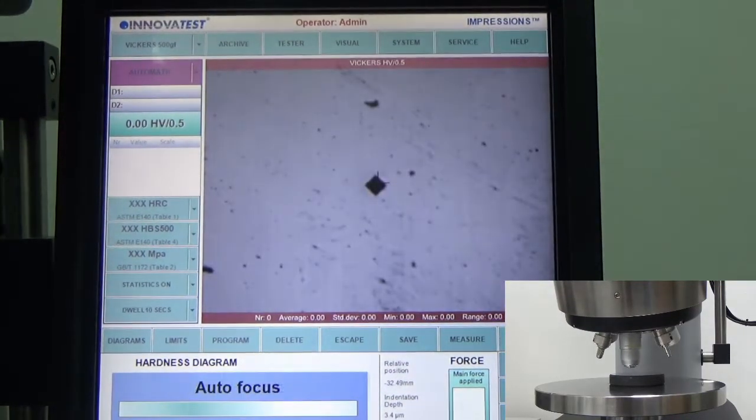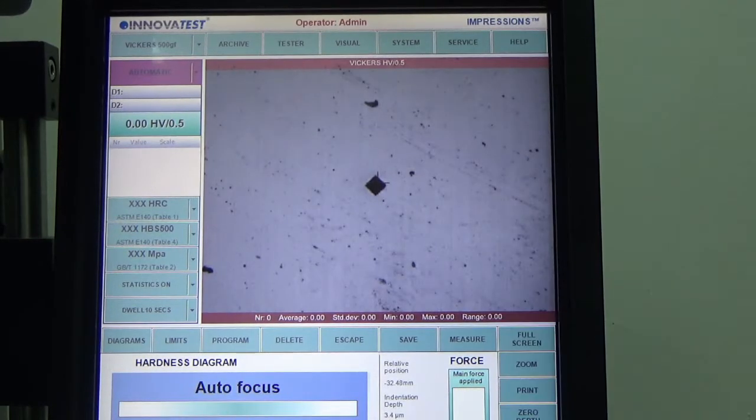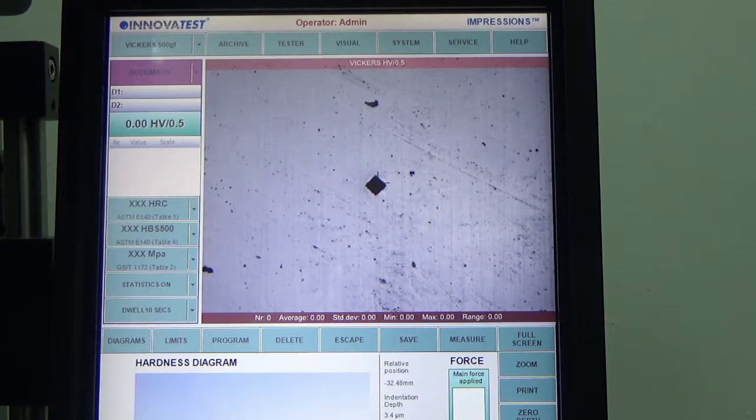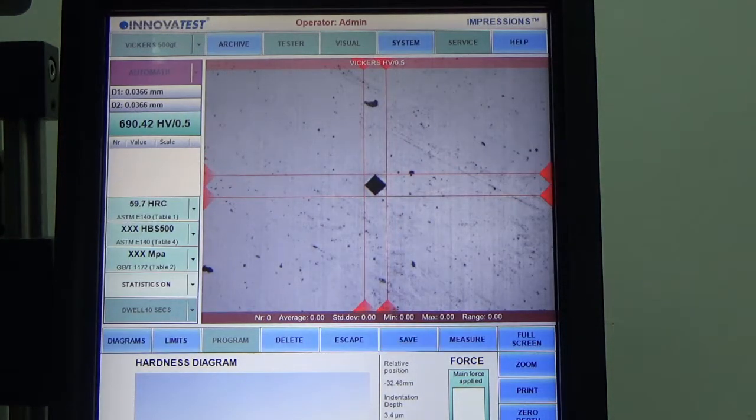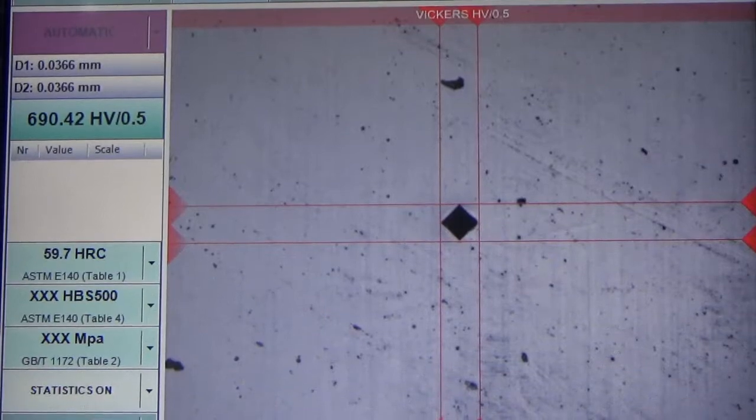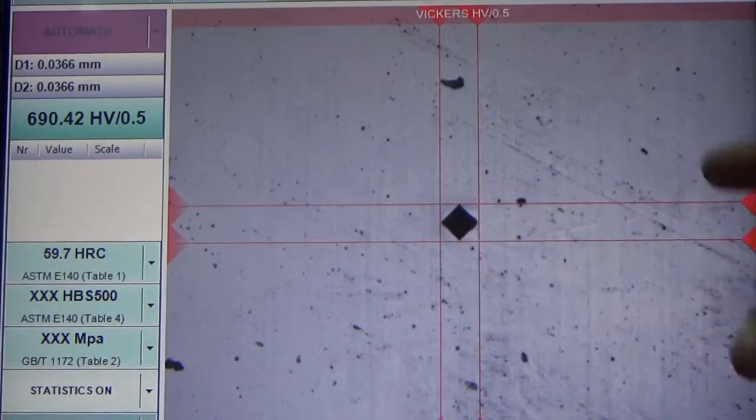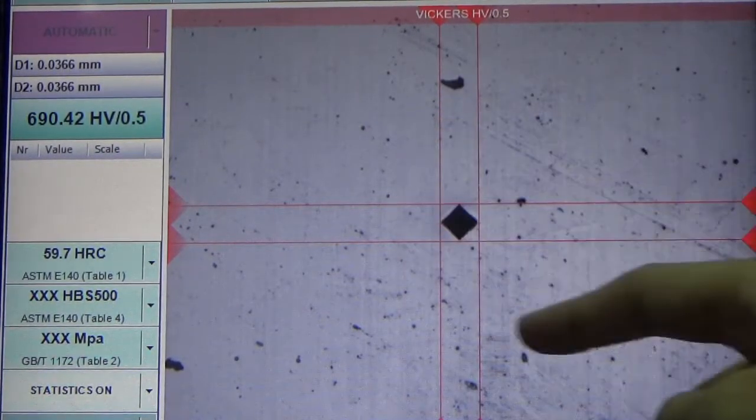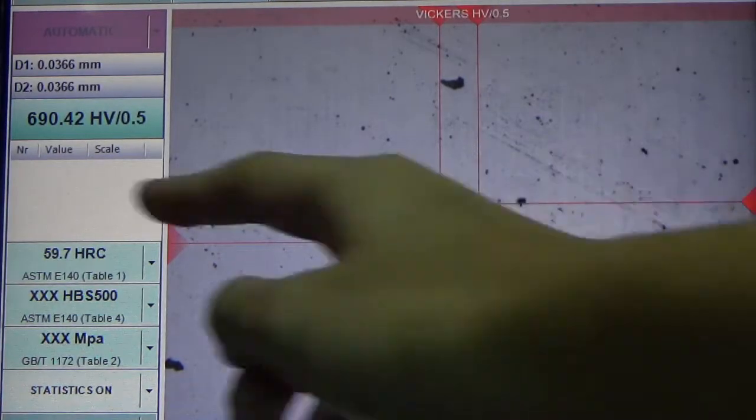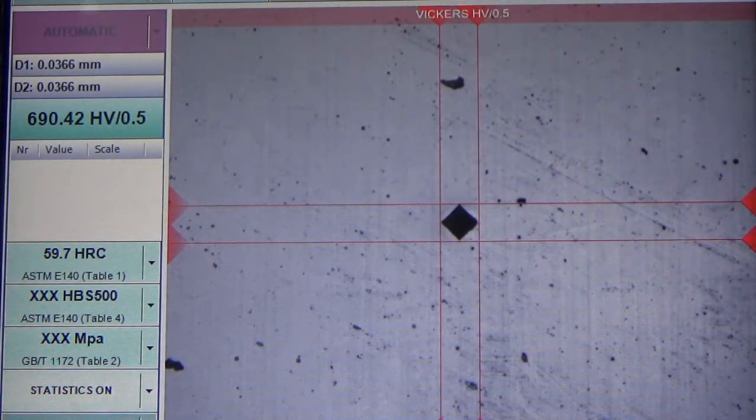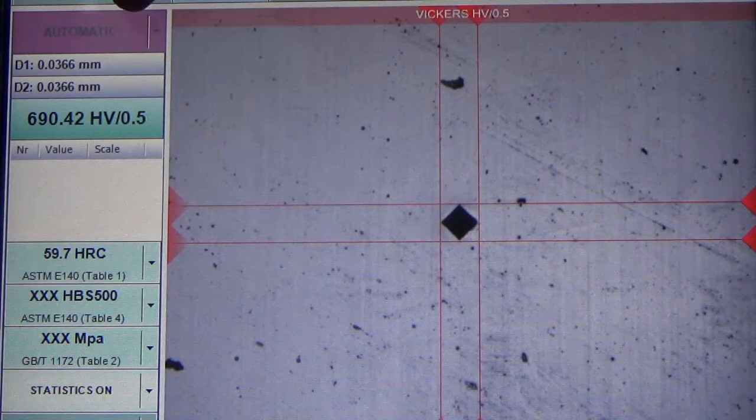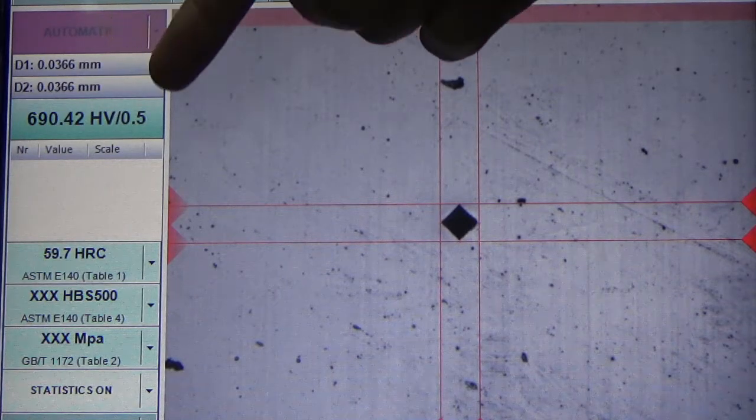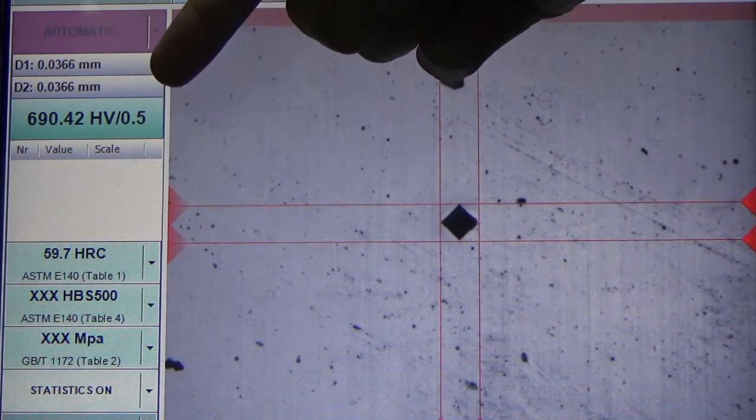It will then automatically focus on the indent and measure by itself, giving you the reading. As you can see here, you'll be able to see the indent as well as the measurement lines by the software itself. You'll be able to see the D1, D2, as well as the final Vickers value for this measurement.